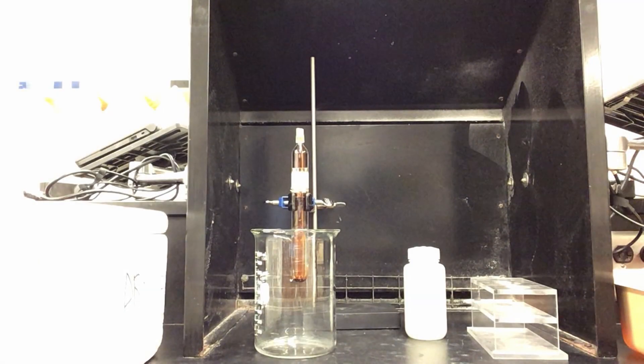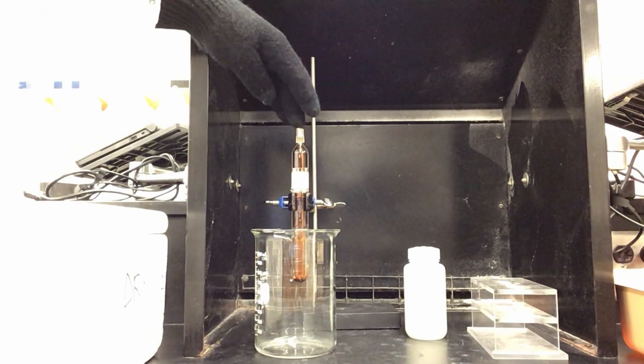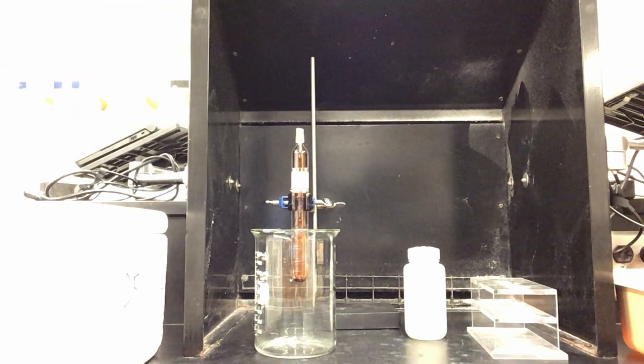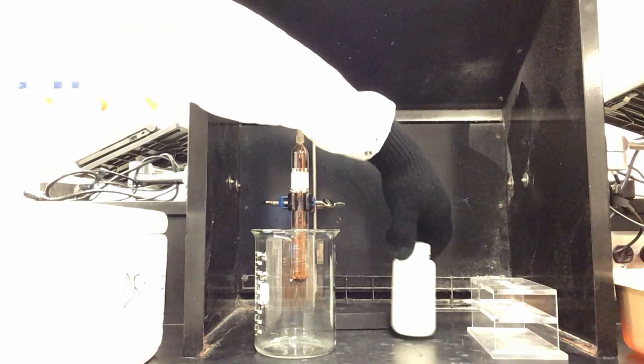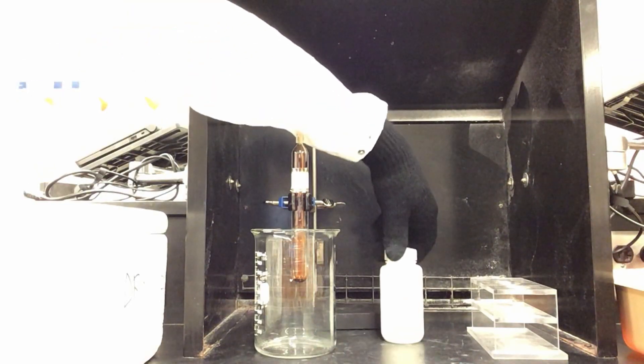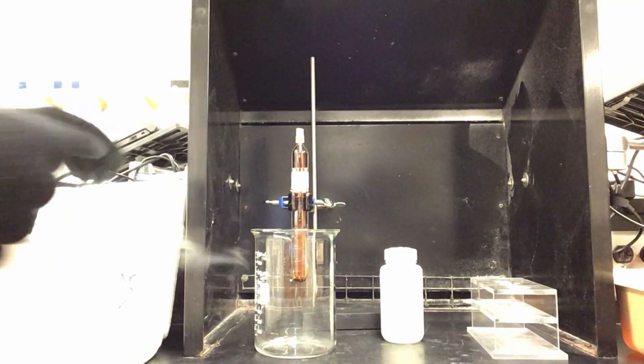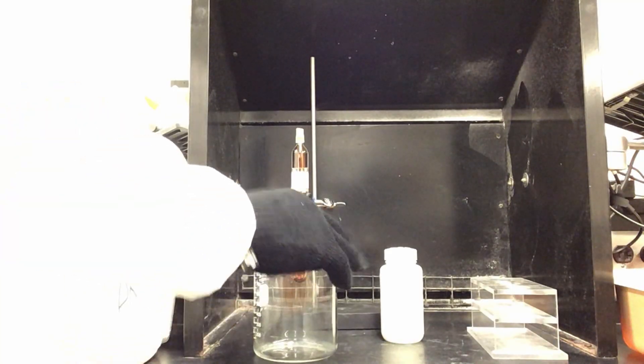Here is our setup in the hood for demonstrating the equilibrium of bromine between a liquid and vapor. We always work with a bottle of sodium thiosulfate nearby in case of any breakage of the glass, because the sodium thiosulfate will help neutralize the bromine. I'm going to add dry ice to the beaker.